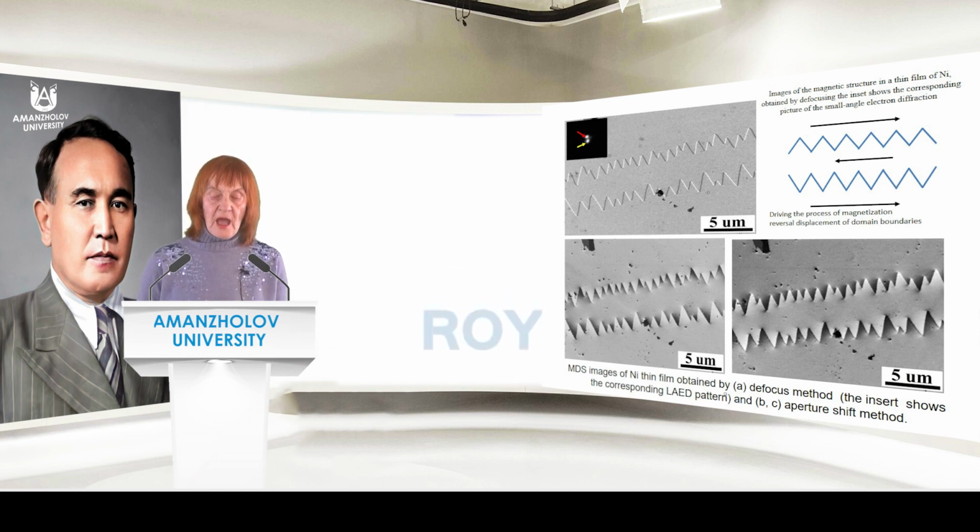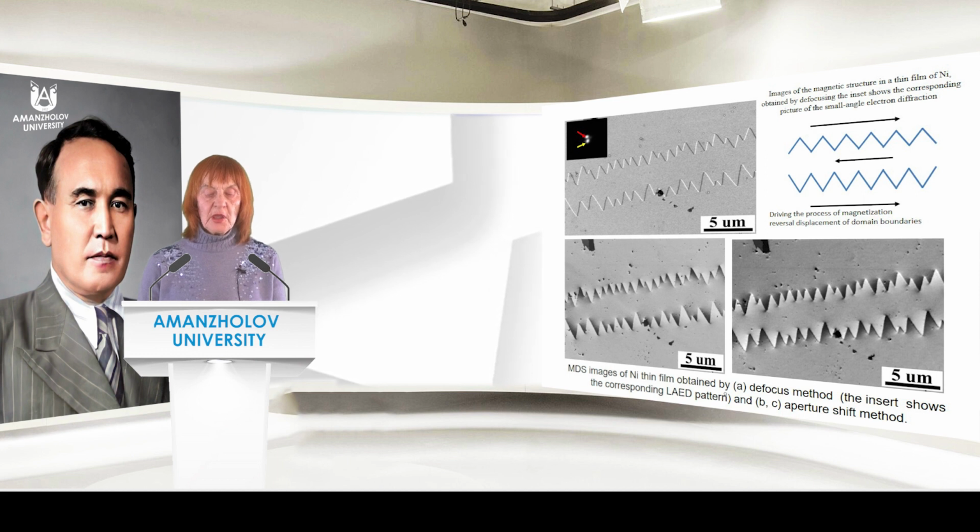The pictures are magnetic domain images obtained by the aperture shift method and correspond to the closed upper and lower diffraction peaks. See inserts in the figure, respectively.